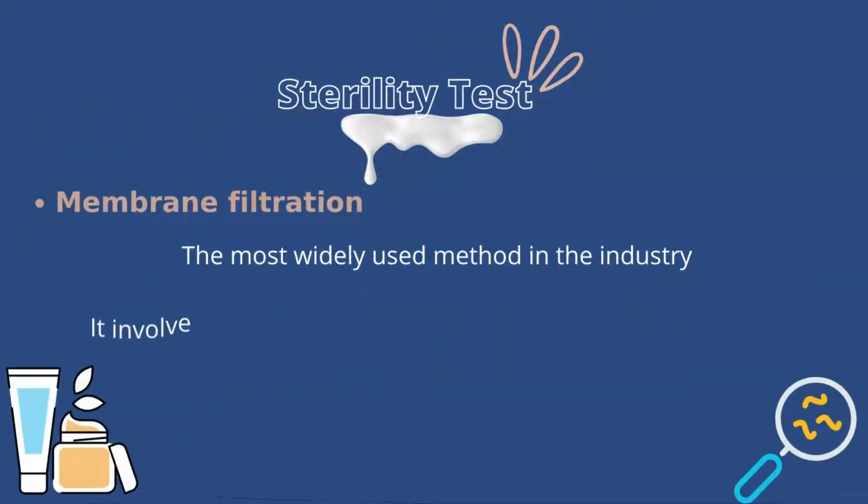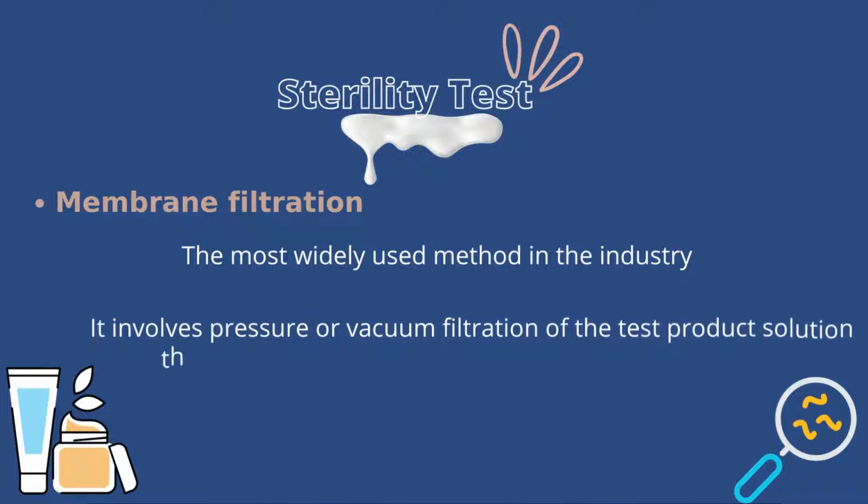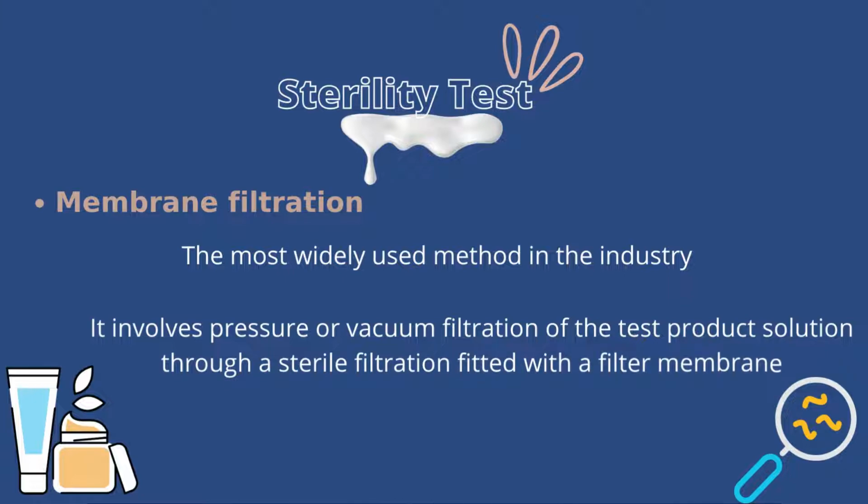Membrane filtration. Membrane filtration is the most widely used method in industry. It involves pressure or vacuum filtration of the test product solution through a sterile filtration unit fitted with a filter membrane.